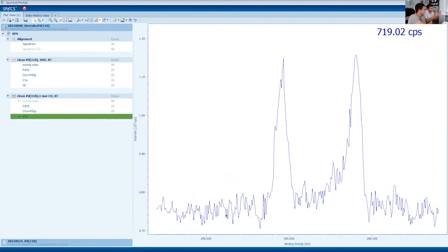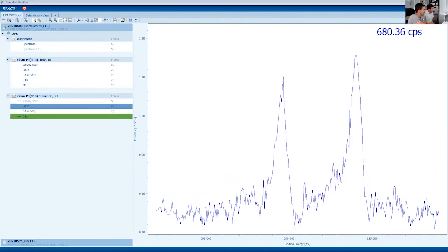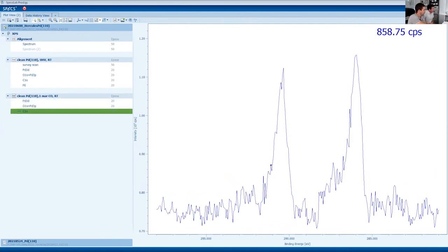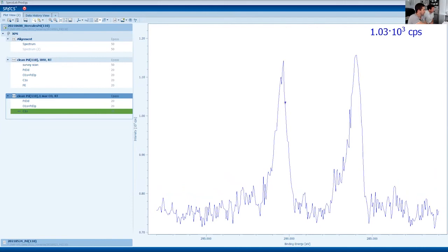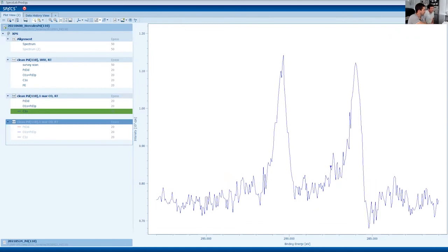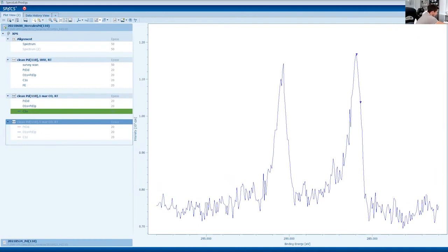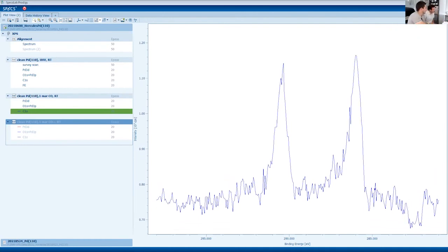Check the position of the sample relative to the nozzle and see what we can do, because we have the quadrupole connected, so it is an experiment not with only one gas, right? Because it's more interesting in the combination, the oxidation.